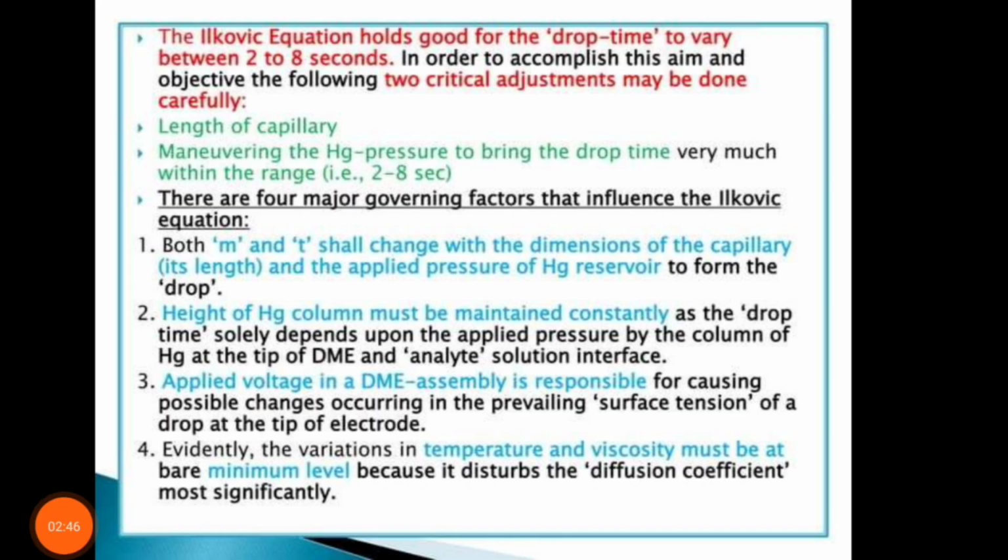Third, the applied voltage in a DME assembly is responsible for possible changes in the prevailing surface tension of a drop at the tip of the electrode. Evidently, variations in temperature and viscosity must be kept to a minimum because they disturb the diffusion coefficient most significantly.